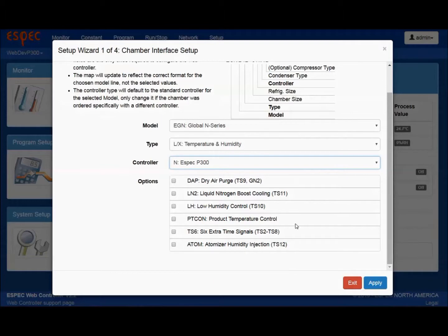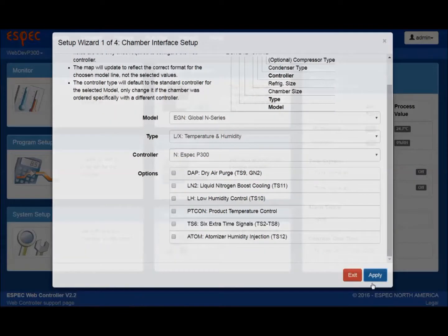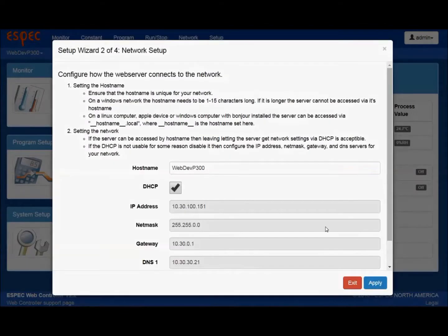To find out which options are included on your chamber, visit ESPEC.com/manuals and type in your serial number. Section 2 of the setup wizard walks you through the network configuration and should be automatically detected if your controller is set up on the network. If you are using a static IP, you will need to manually add your information and uncheck the DHCP box.